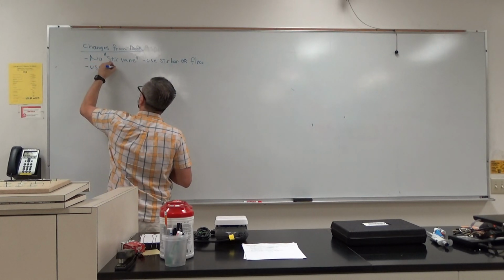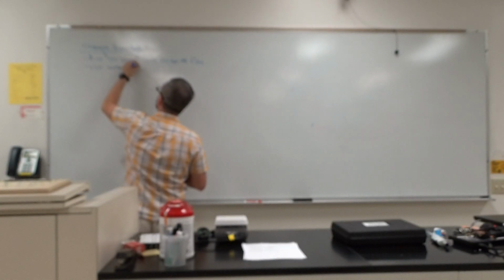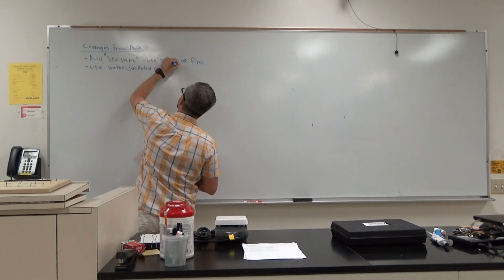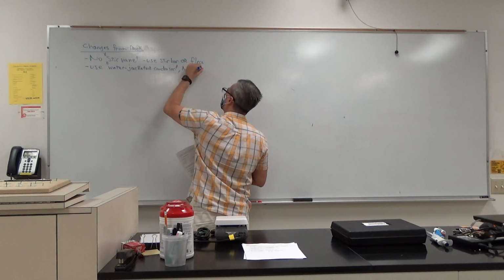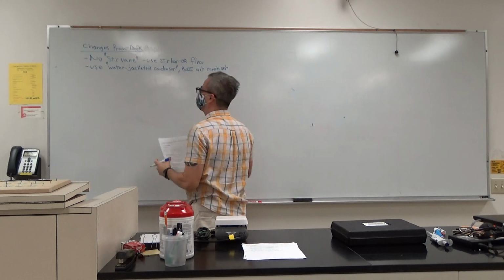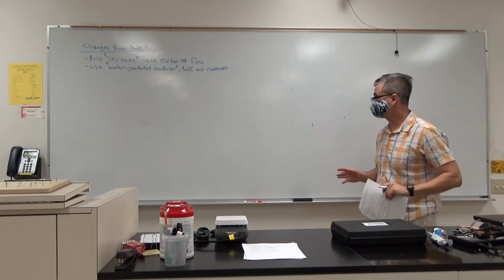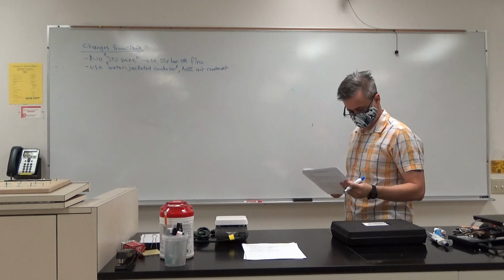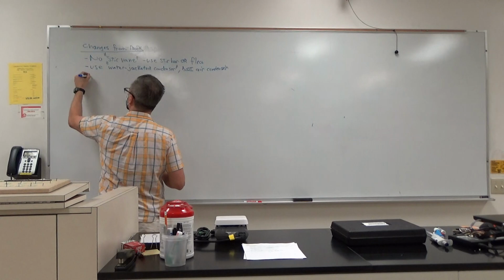Use a water jacketed condenser, not an air condenser. I'll show you the difference in a second. This will keep the air quality in here better. Otherwise, when you use the air condenser, it sounds like you're swimming in a vinegar bottle. That's acetic acid, and it's really strong. And we actually had one student who felt sick from it, so we made that change.